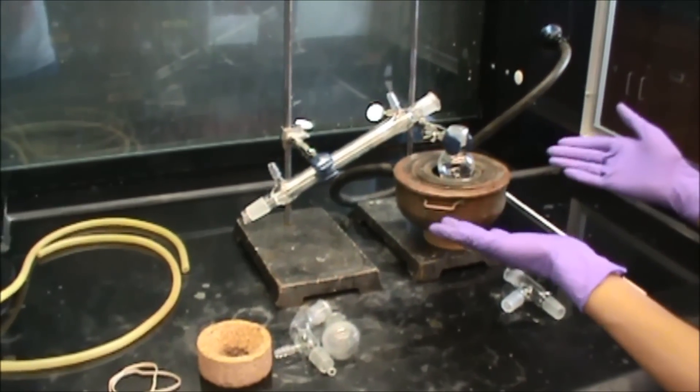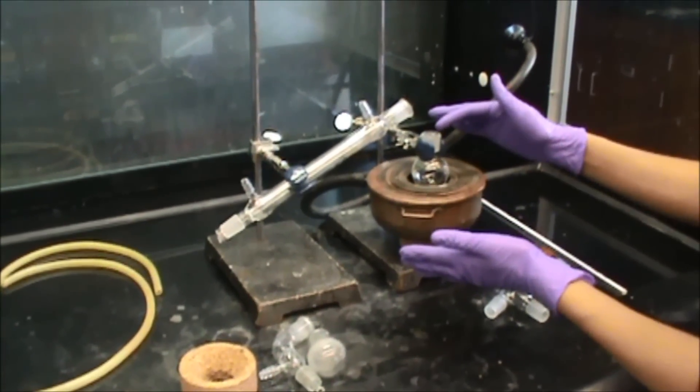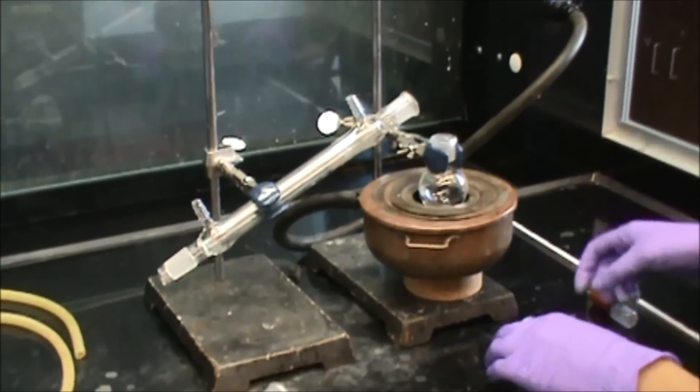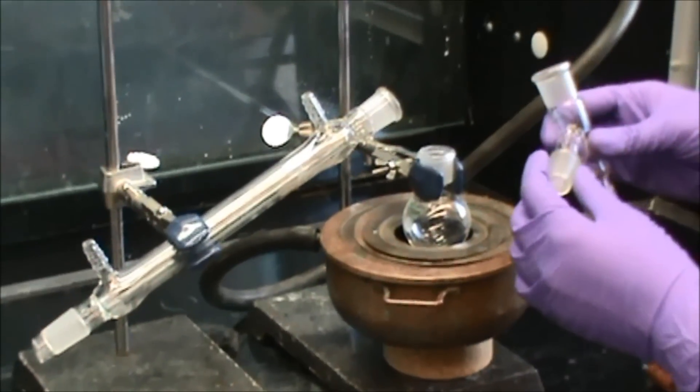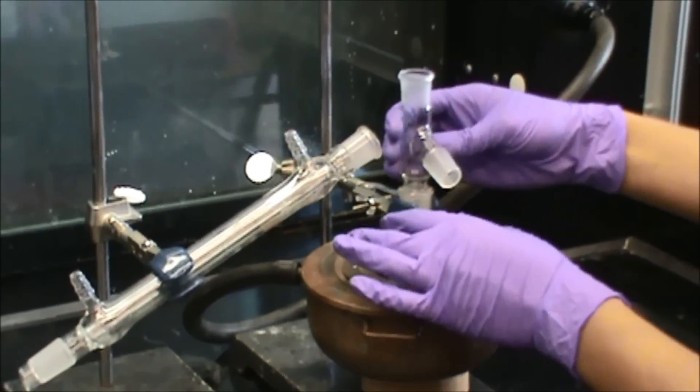As you can see, I have partially set up the distillation setup here. We have the heating mantle and the distillation pot on top of it. What I'm going to do next is get the distillation head and connect it to the distillation pot.